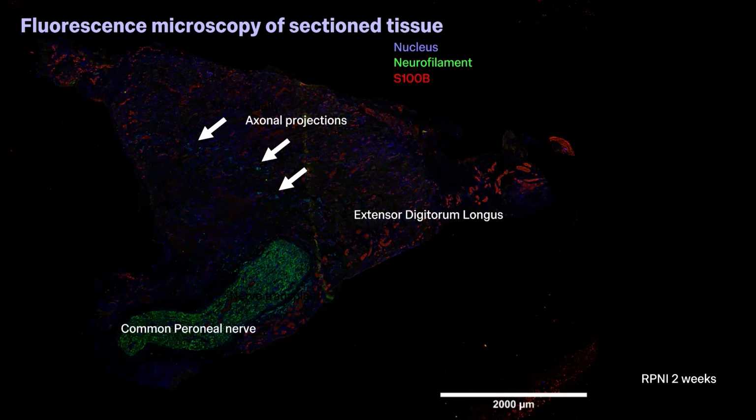And depending on the way that you do your staining, you can overlay your samples. This is not an overlaid sample, but this is the same kind of sample preparation, but with immunofluorescence for neurofilament to identify where we have our axons, S100B, which we were using as a marker for potential myelination provided by Schwann cells in the peripheral nervous system, and a general nuclear stain just to get a good sense of the whole tissue architecture.